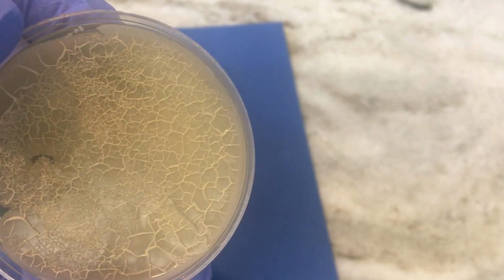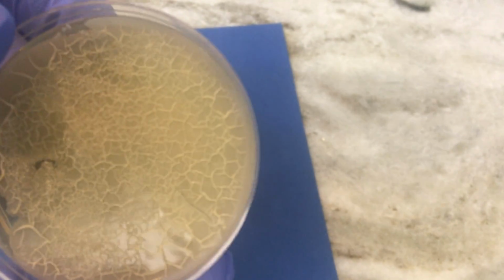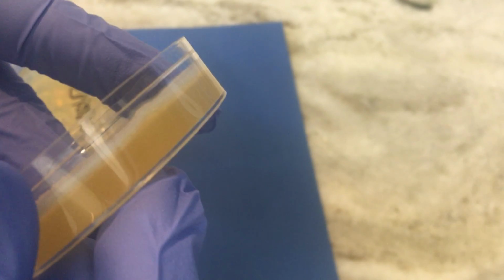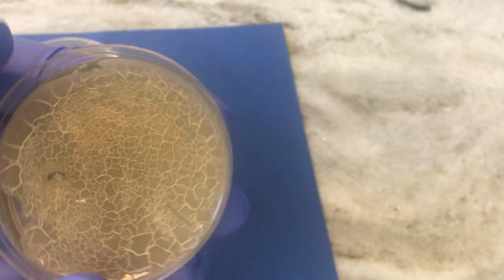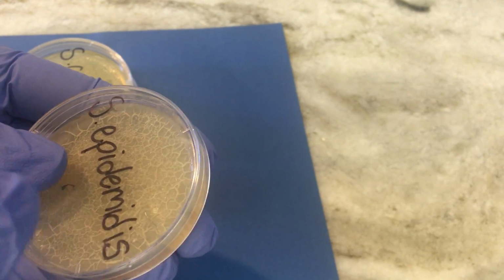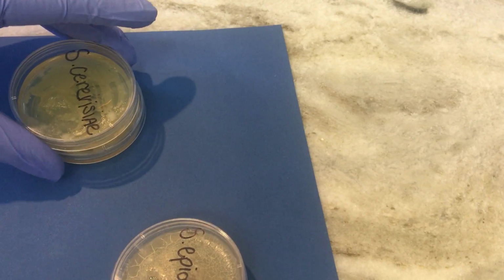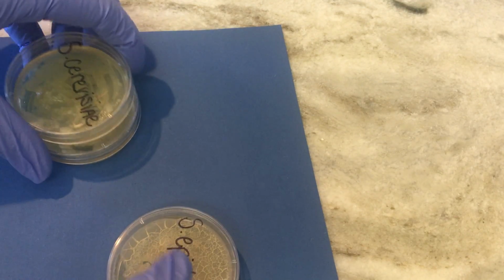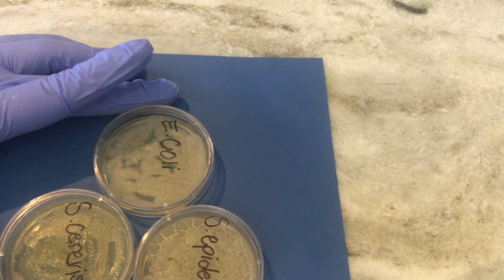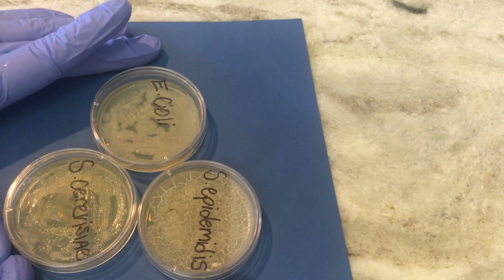So I don't know if it was contaminated or the agar dried out, but if you look on the side, you can see a bacterial layer. So there's some growth there for sure. So that could definitely be on my error. I'm not sure. But these are my three microbes. There's some contamination, possibly, but we definitely see some growth.